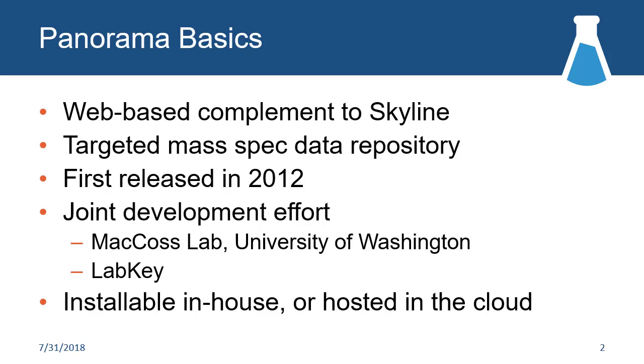So like Mike said, this trailed the development of Skyline by a few years. The way that we think about it is it's a way to help organize this mountain of data that you're going to be generating as you start cranking up with Skyline, creating lots of documents, analyzing lots of samples, wanting to analyze across all of those, or just go back and say, wait, didn't I set up a method for this peptide before? Where was that? And so this is a web-based complement to Skyline itself.